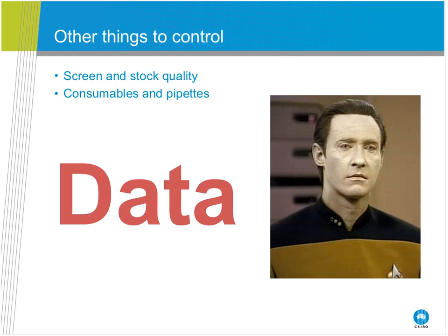If you have any sort of automation at all, it is extraordinarily easy to set up more plates and you can't comfortably capture the information with a pen and a piece of paper. We at C3 probably spend somewhere around a third of our time just managing the information flow into and out of the center. So it's really important to realize that if you can't find the information about a particular experiment, you may as well not set up that experiment because you've just wasted time. So it's always a question of being able to go back and find out what you did.